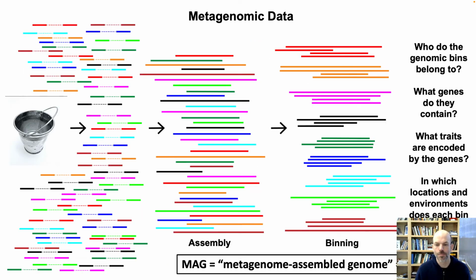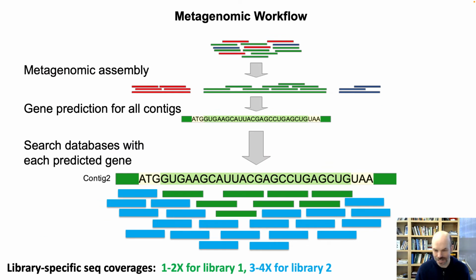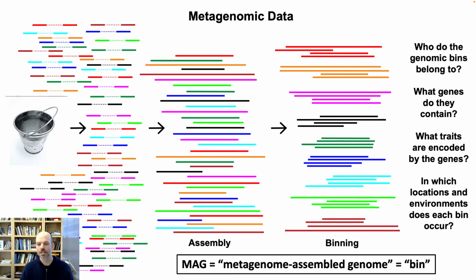Okay, so that's how you get abundances from contigs, which again are assembled from metagenomic sequences. All right, so another layer of analysis that you can layer on top of the assembly stage is to bin the contigs. Before, I was talking about this stage where we have assembled contigs and we can look at the proteins that are encoded by those assembled contigs.